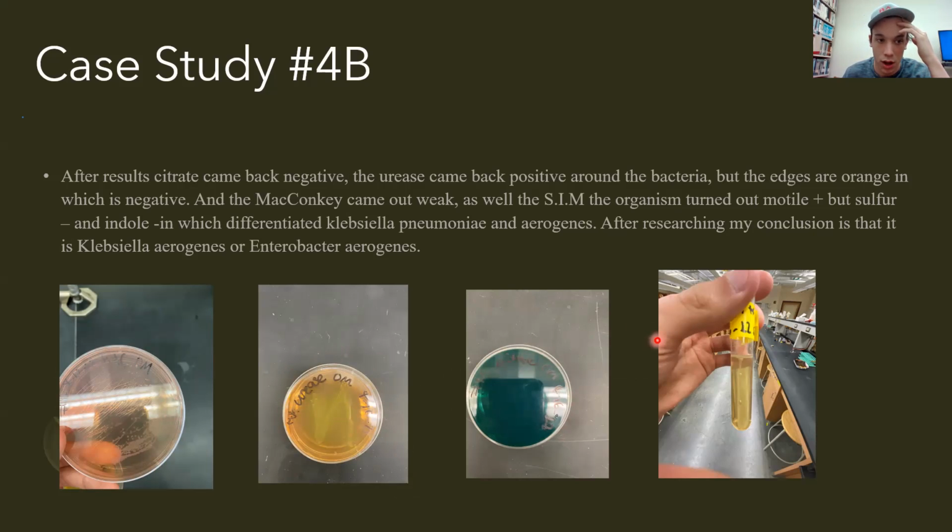Then I did a SIM test. The results seemed to be more motile from the stab site, because it went around the stab point. I used Kovacs reagent to see if it would produce indole, and it did not produce indole. It was clear negative that there was no hydrogen sulfide production.